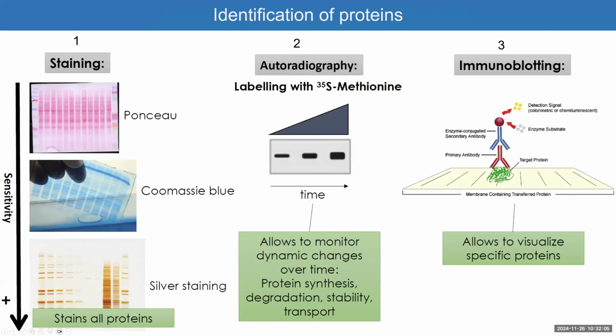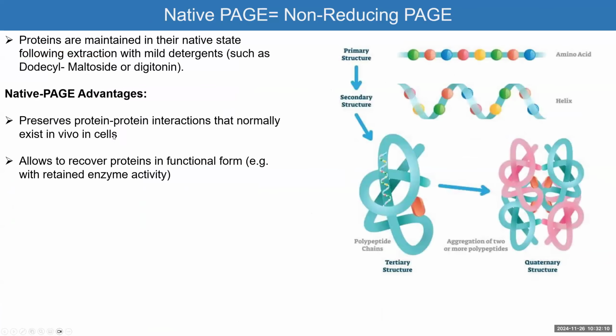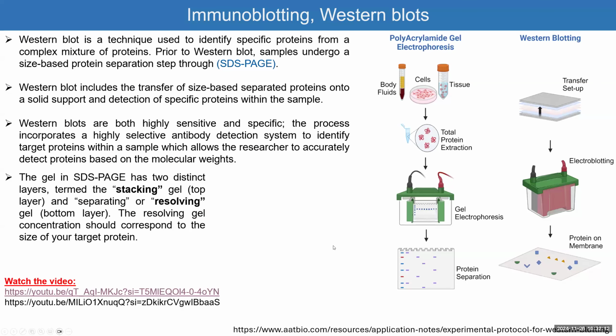The Ponceau, unless you do the Ponceau like that. Okay. So the next step is to take this gel where the proteins are within the gel, and you will put it in a transfer setup, and that transfer setup has paper around to protect the gel and the membrane, which is stuck directly to the gel.